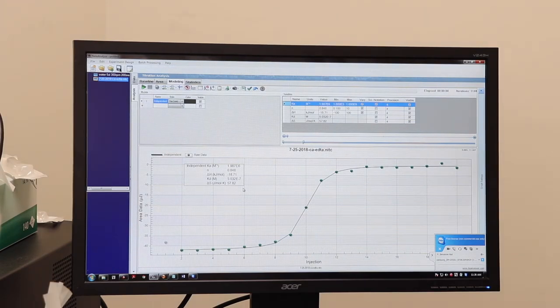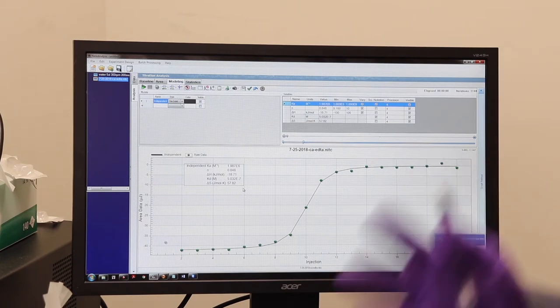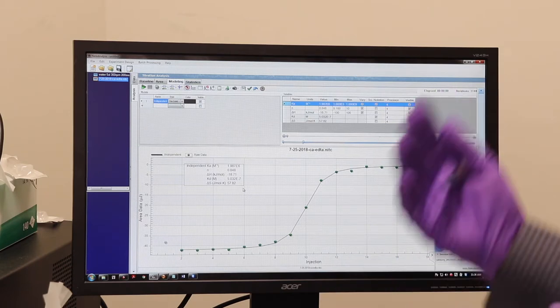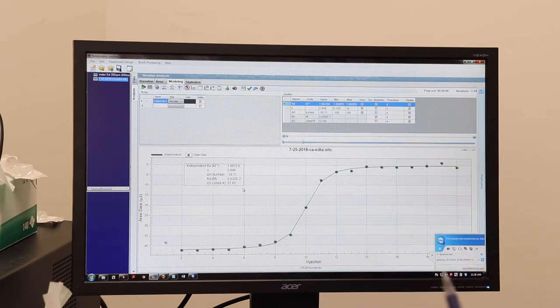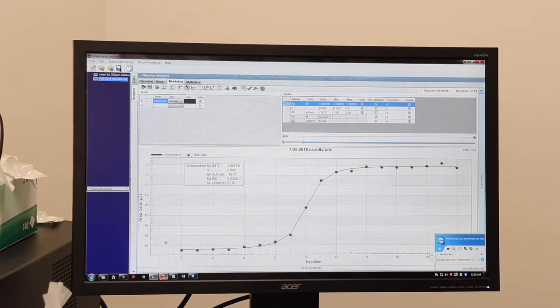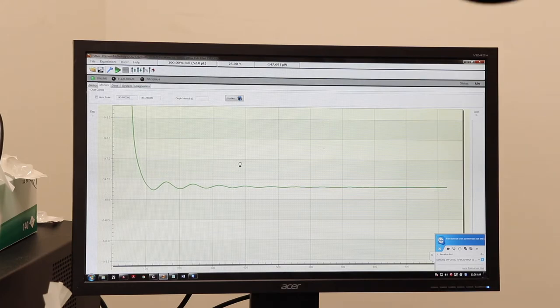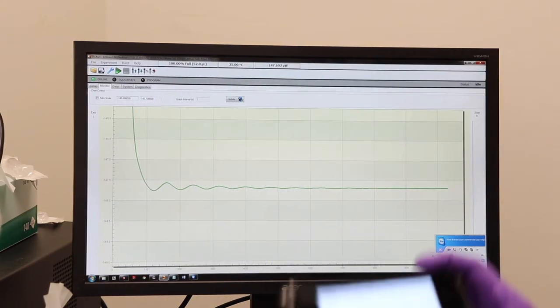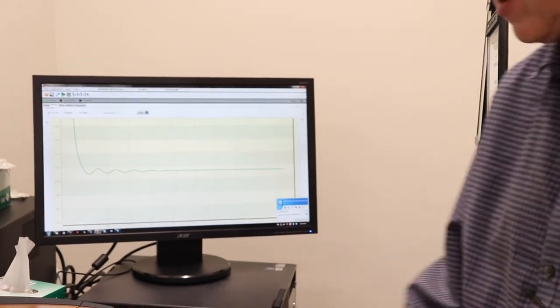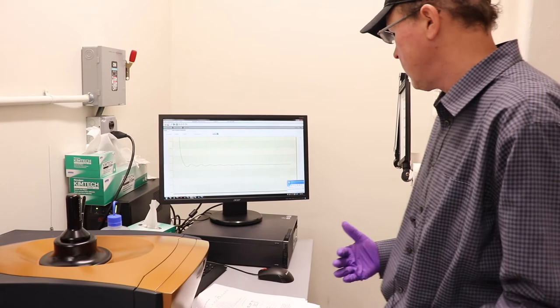So as I mentioned previously, the first day, you'll do a water-water to get comfortable with the system and make sure it's clean. Do your calcium into EDTA and then do another water-water after you clean it. And you'll be good to go. So since there's typically a long equilibration time, there's remote access on this computer a couple different ways. There's a tight VNC program. There's also a team viewer, which is set up on here. So you can see that from your computer up in your lab and watch the monitor over time, especially during that auto-calibration time. Also, you know, thanks to technology, you can get a team viewer for your phone. So you can keep an eye on it. That way you don't have to stand here for the hour of the calibration.